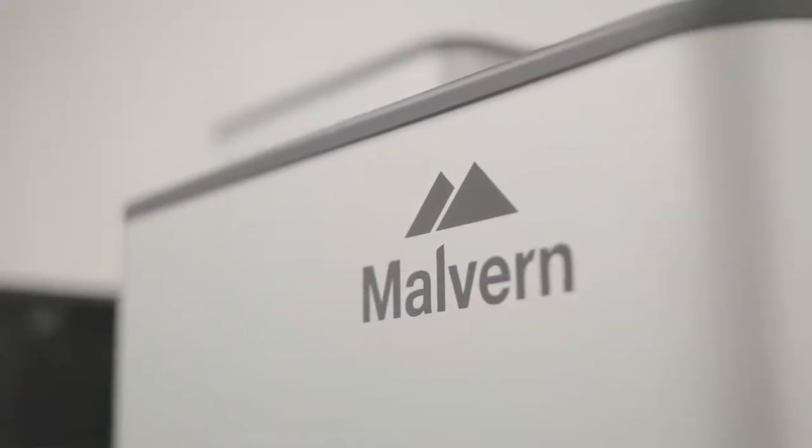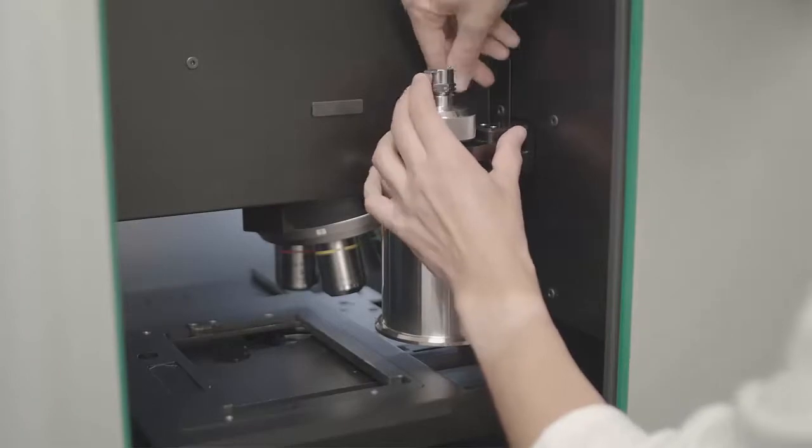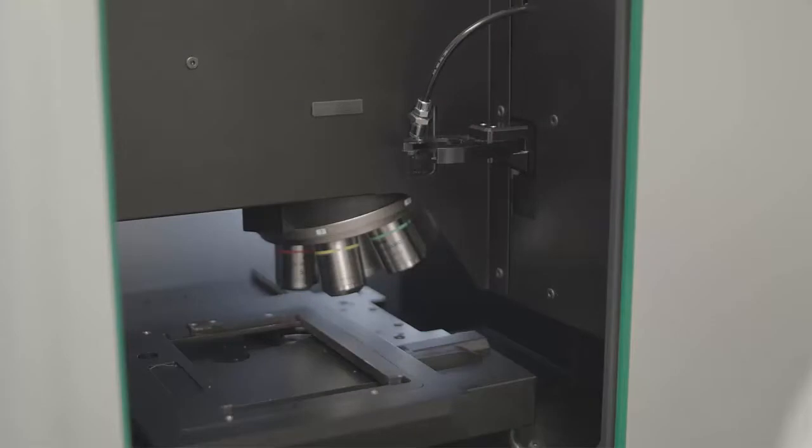Morphologi 4 measures particle size and shape by automated image analysis. Dry powders, such as metal powders, can be dispersed using the compressed air-driven Integrated Sample Dispersion Unit, or SDU.